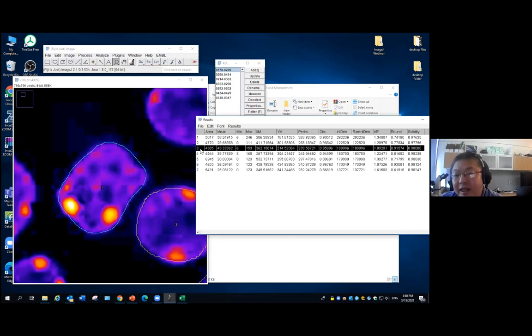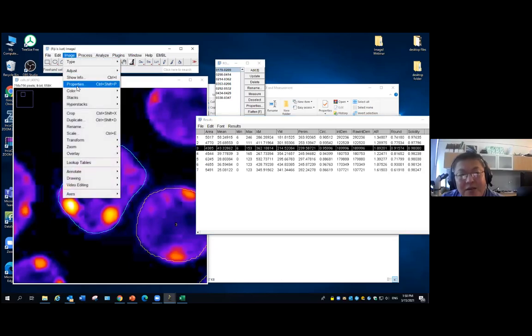You only need the scale to convert it back by the end. We calculate how many pixels, but I want to know what size one pixel corresponds to exactly. That information is saved as what we call the pixel scale. So you can check your pixel scale in the image properties.